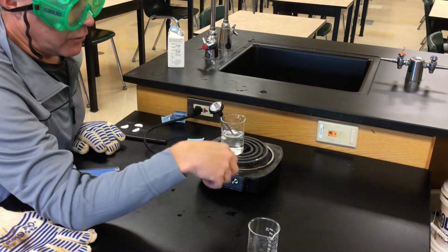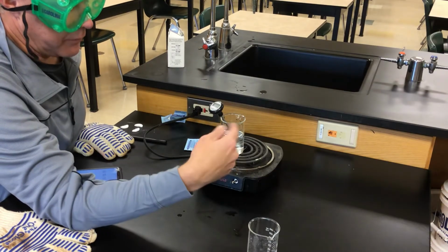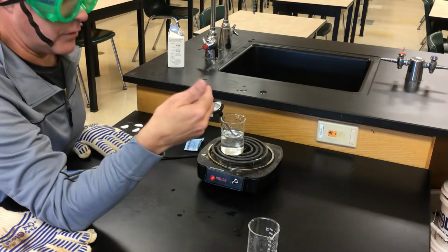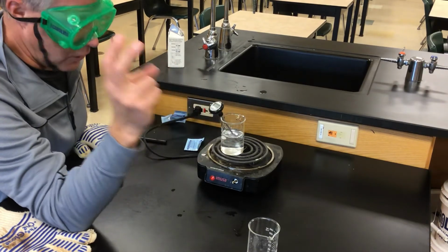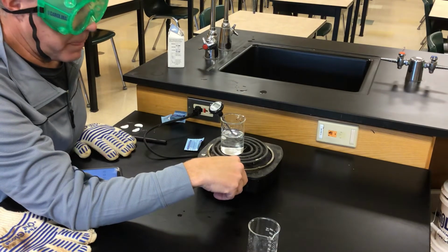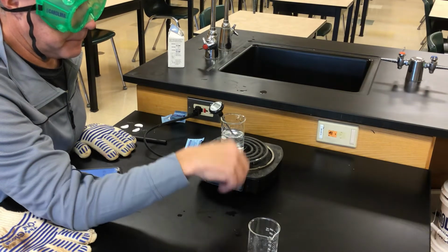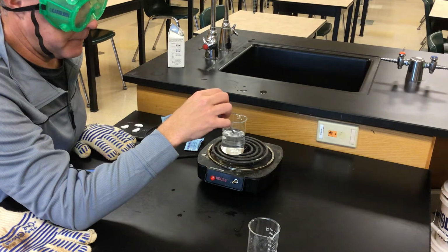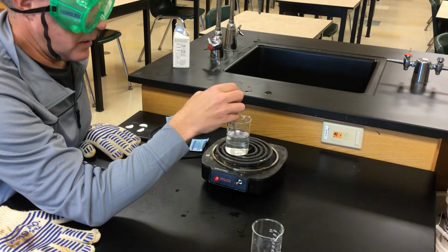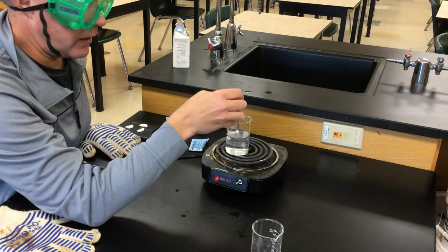I'll have to stop it a little before 36 because it'll keep going up after I take it off the water. It takes water a long time to heat up, but once it gets there, it takes a long time to cool down too. So you gotta be careful because once it gets cranking, it can go pretty fast. I'll probably take it off at about 35.